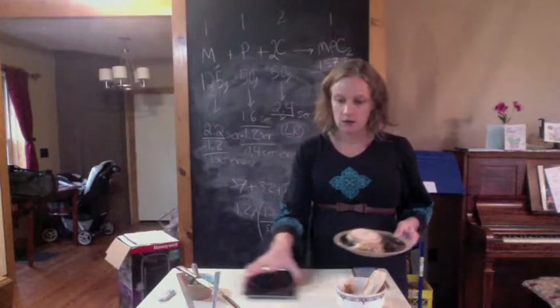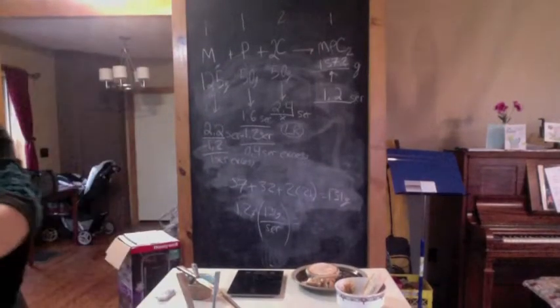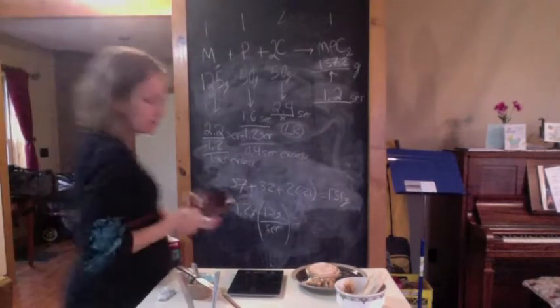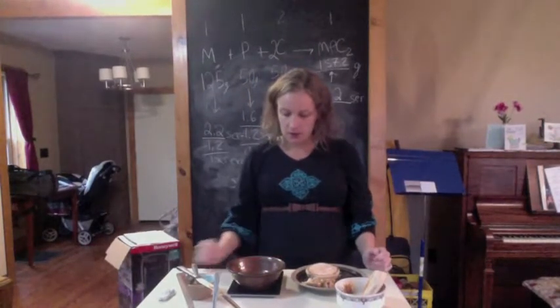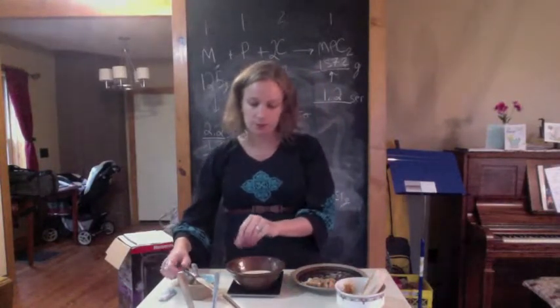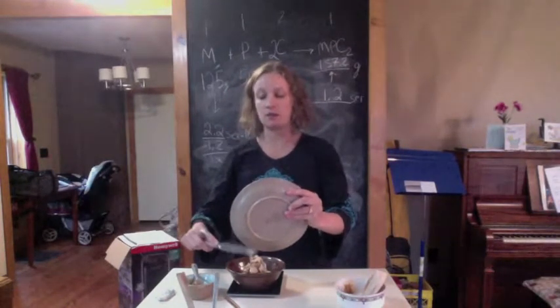Now actually, I would have to re-tare the plate. So I'm going to just take out another plate. A bowl, actually. That's what I had. And I'm going to tare it, meaning push 0, so that it is only going to measure our product. And I'm just going to put everything in this bowl. So we have our 1.2 of our product. Now let's find out what it weighs. I'm curious.